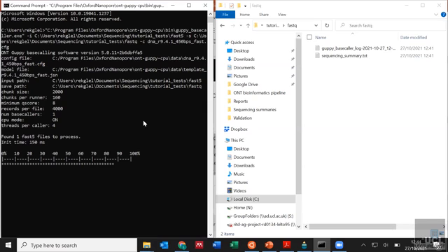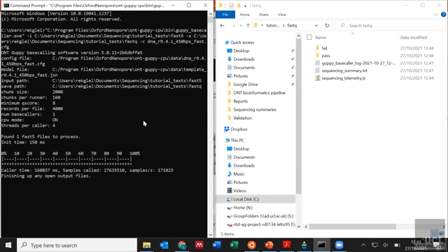And so all of those will be roughly the same size. But if you're sequencing directly from native DNA, so stuff that you just directly extracted without specifying size, then you can get all sorts of lengths of DNA. So for instance, some people can get up to hundreds of thousands of bases. Some of them will be a lot smaller.